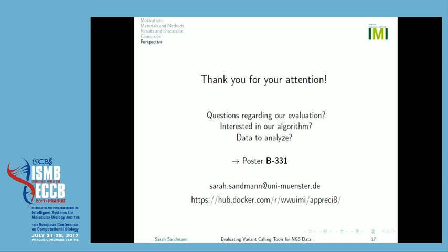Thanks for the talk. So when you do this reproducibility test, have you checked on those different variants whether they are biased to some low-frequency variants? Excuse me? When you check this reproducibility, you run the variant caller several times and see the differences. So whether the variant differences are biased to some low-frequency variants, or in other cases, some bias?